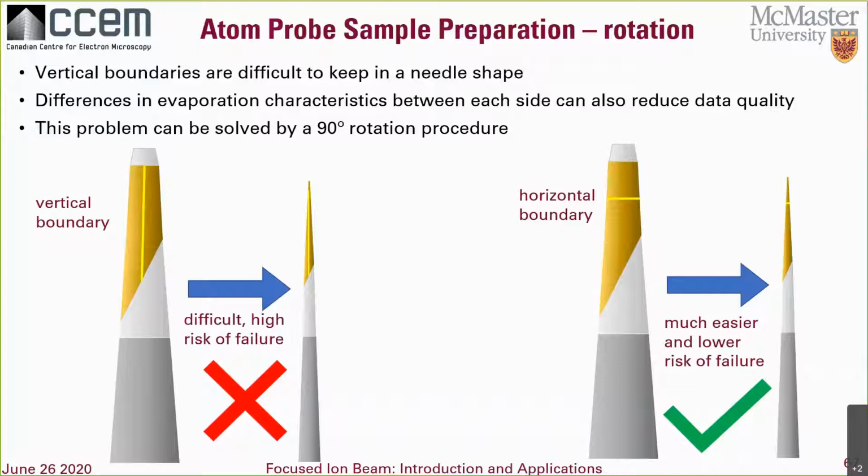If the boundary could instead be forced into the horizontal orientation in the needle, then you no longer need to worry about the precise X and Y position of the needle because the boundary goes through every possible vertical line.